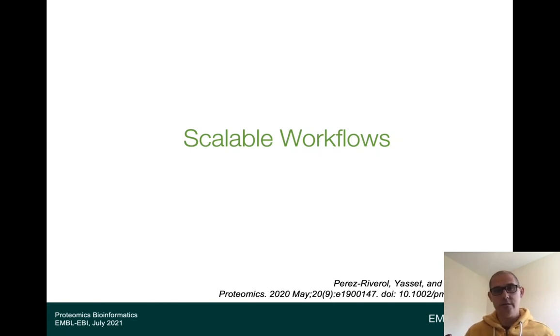This process of sending to a machine, getting the results there and retrieving them into one place. This is the task, and then sending the output of this particular task or node into another step. This is what workflows allow you.